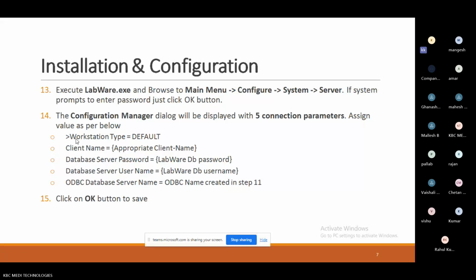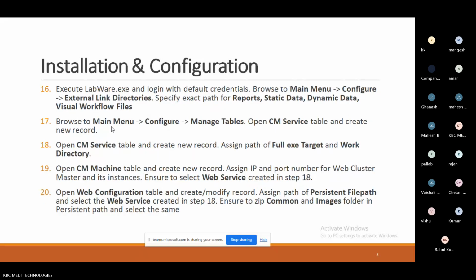So when we discuss briefly, I will open any one of the SQL servers. I will show you how to keep all this information, like how to set up the database server password, username, how to enter, what was the database server name, all that information I will show you. And now I have completed installations. Now going forward, I need to do configuration.